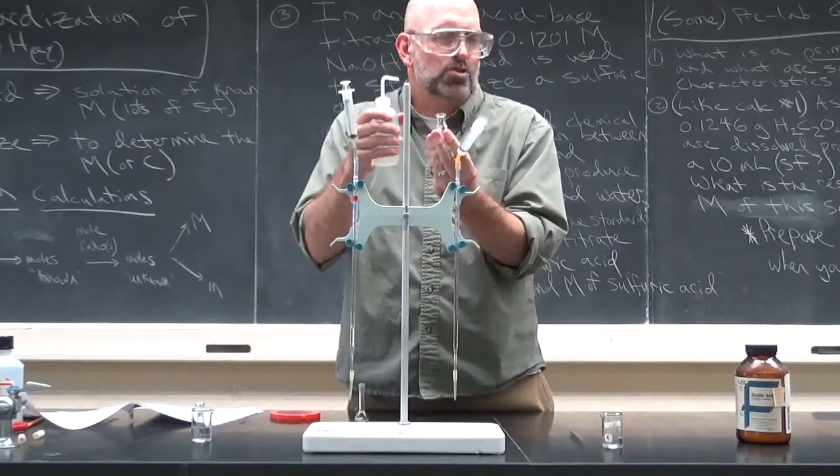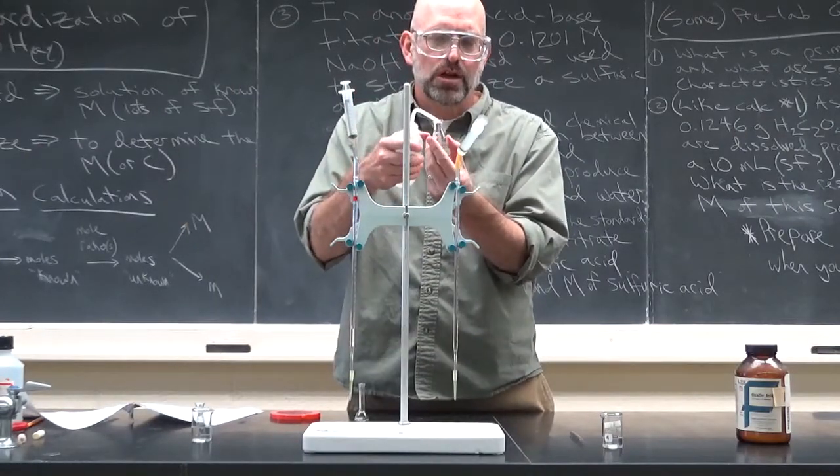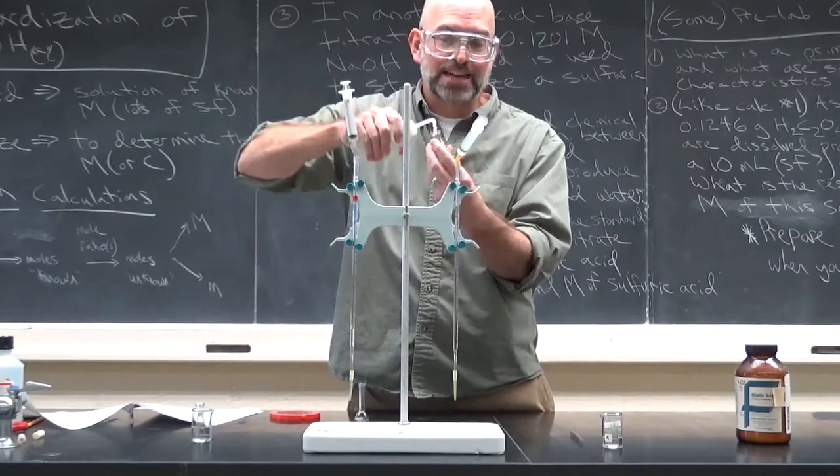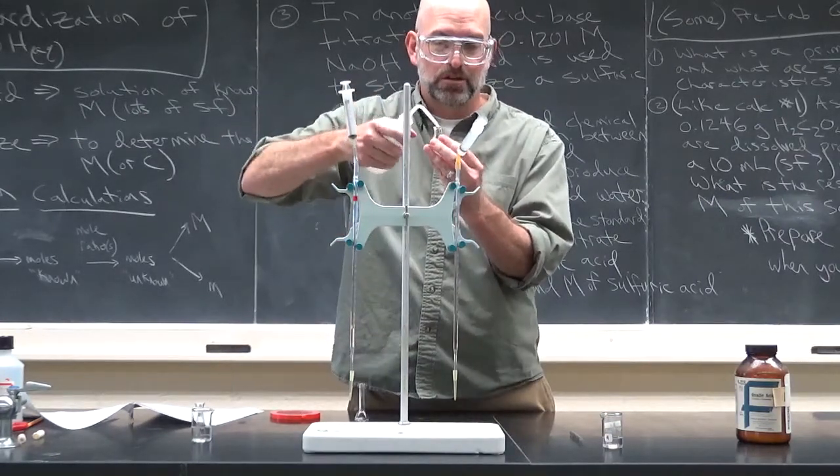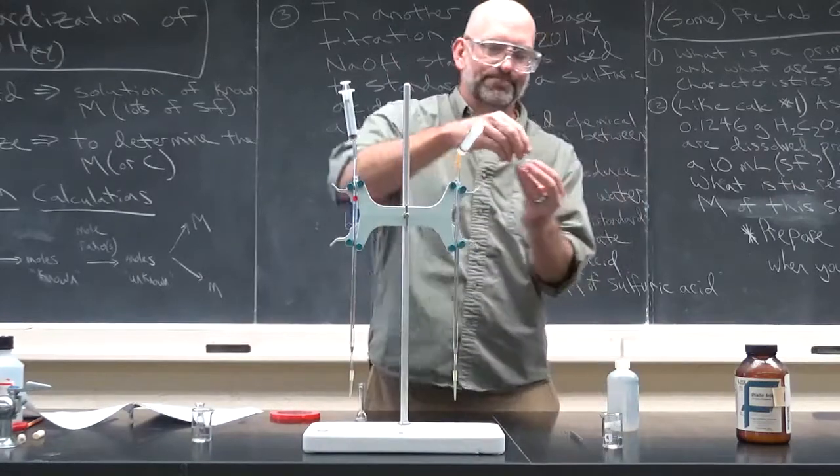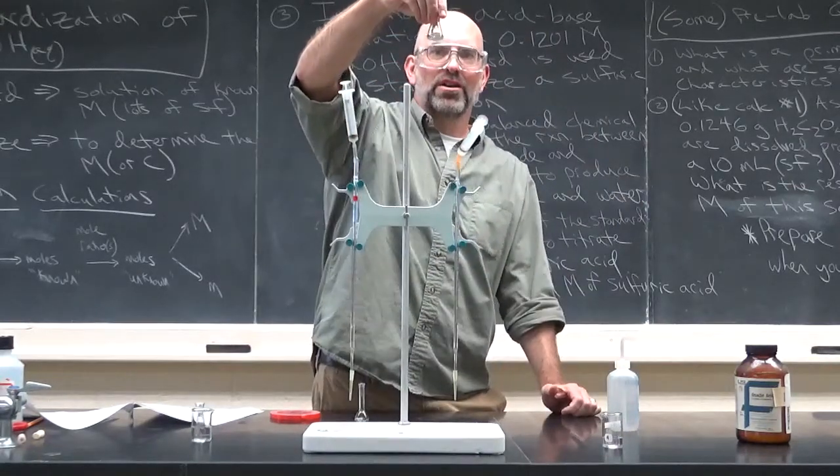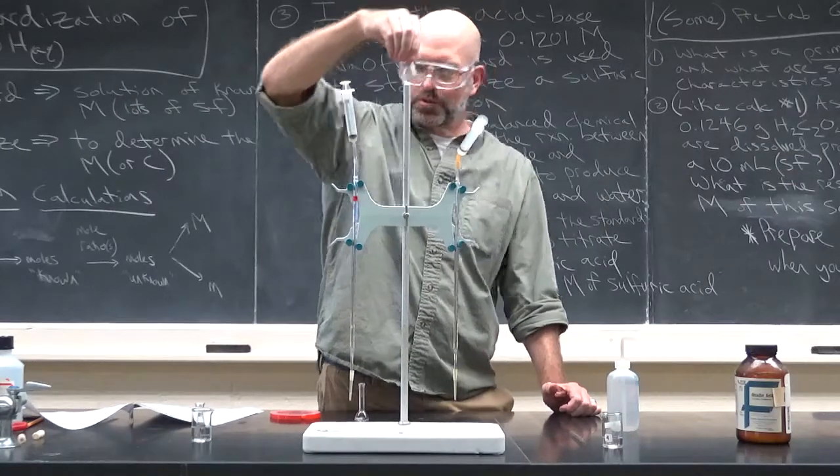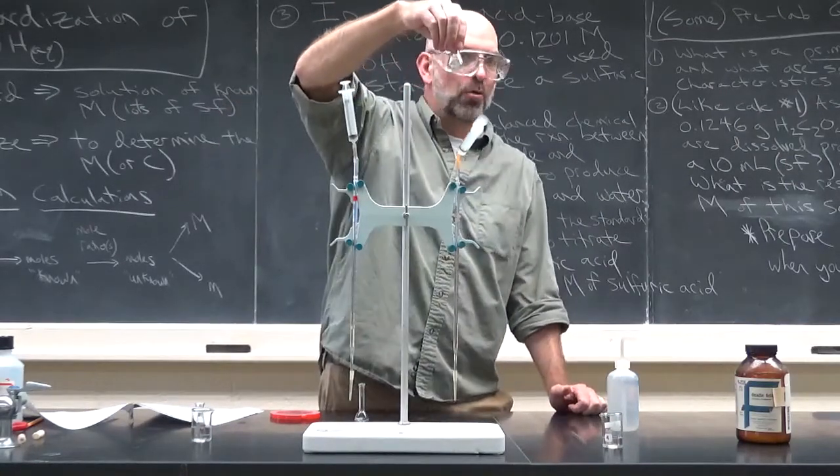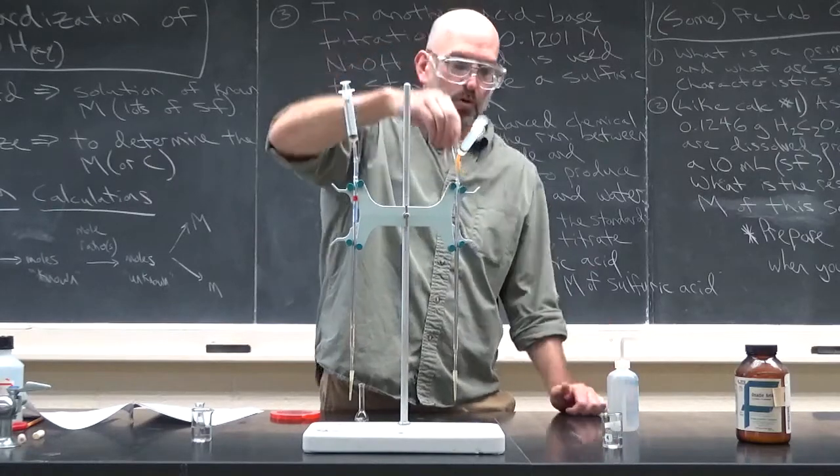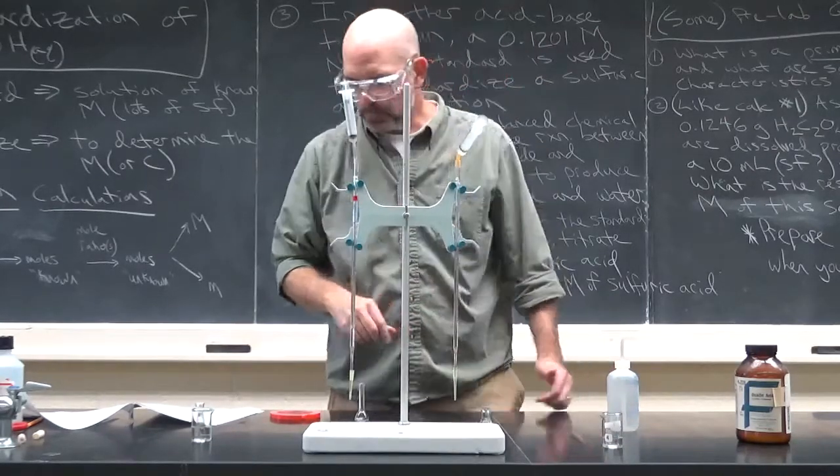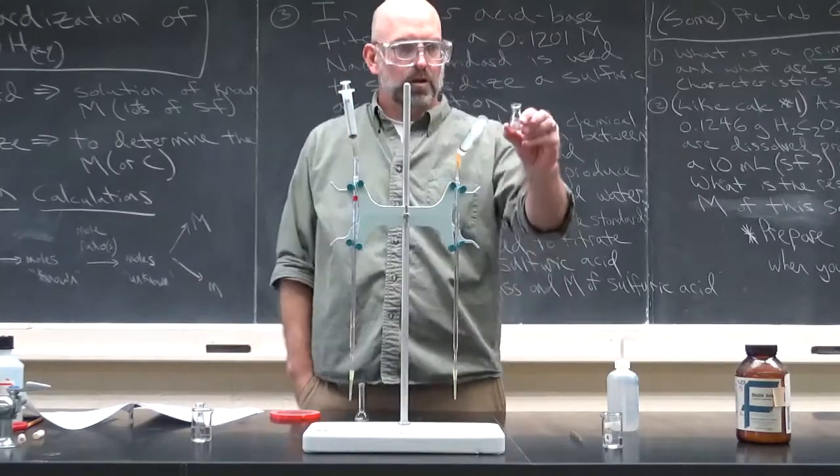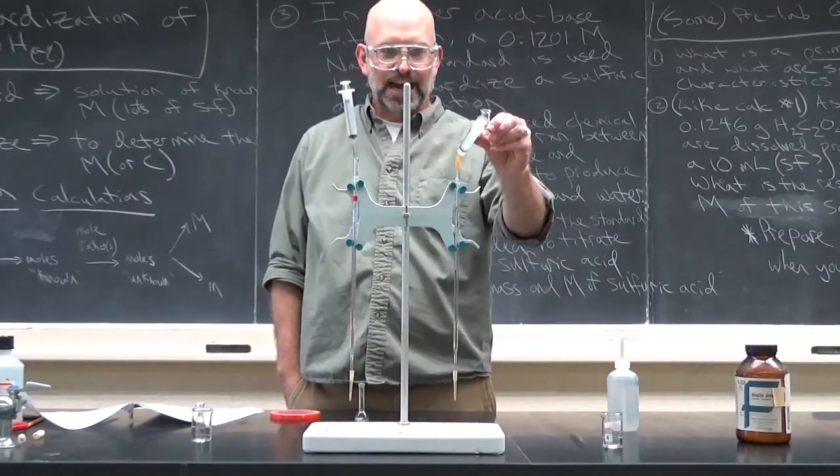So, I'm just going to do this for argument's sake. So I'm going to wash the sides of the Erlenmeyer flask down. And that's, well, that's probably too much water. I have a total of about five milliliters in there now. And the total should only be about three. But you know what? That will probably be fine. But we'll find out. Okay. So your oxalic acid is ready to titrate.